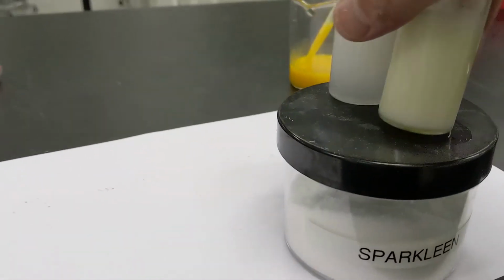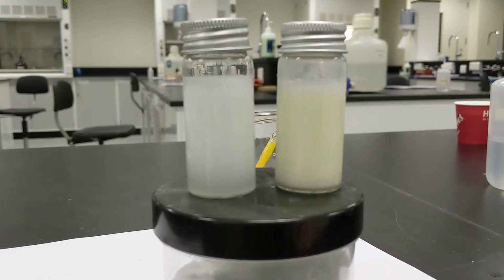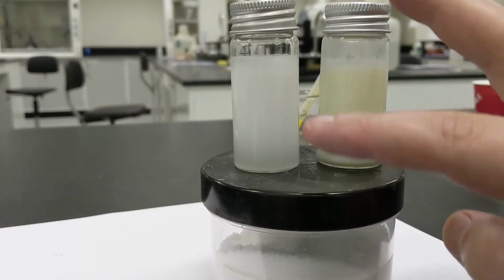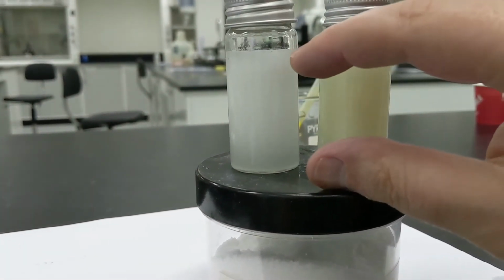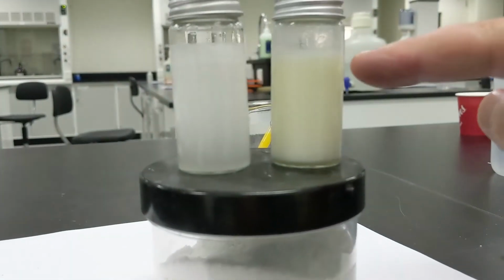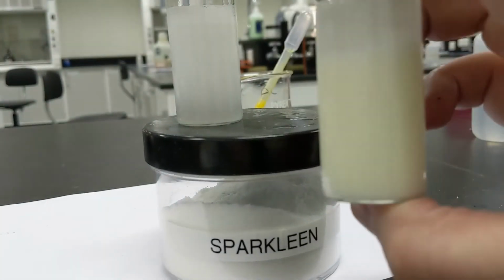So it's been a minute now. I'm going to let these go even a little longer here for science, but it's actually been a minute and 30 seconds, and I'm not really seeing the layers like I did before. Now again, soap will create bubbles on top, but the liquid layer, not the gas above it, but the liquid layer is still one solution. The egg yolk is even better, right? This looks like just one solution. Pretty impressive.